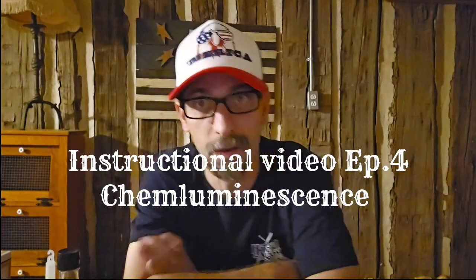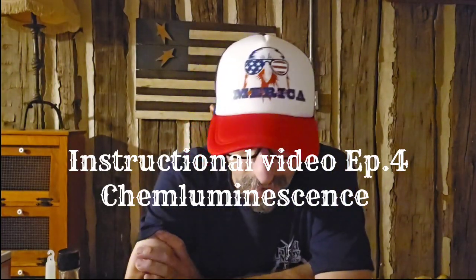Hey everybody, this here is going to be instructional video 4. Alright, we're going to go ahead and do some chemiluminescence. Alright, we're going to make some of that.